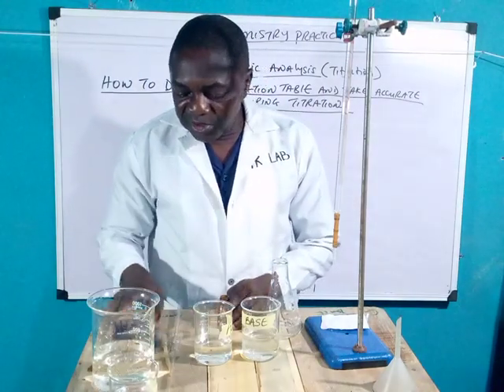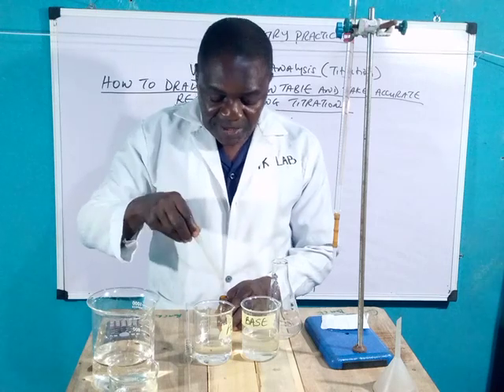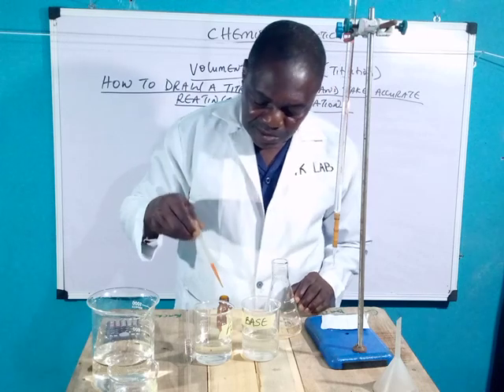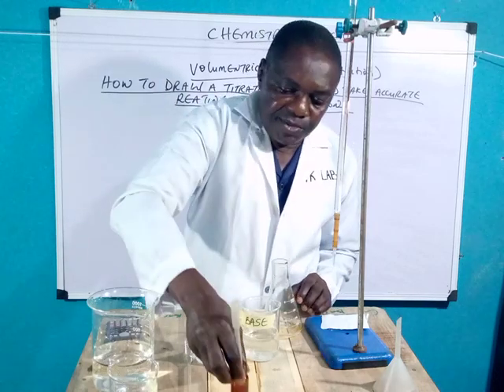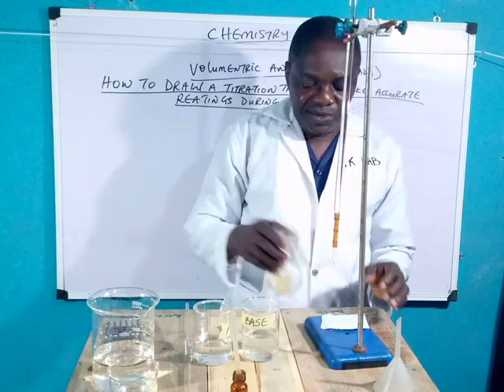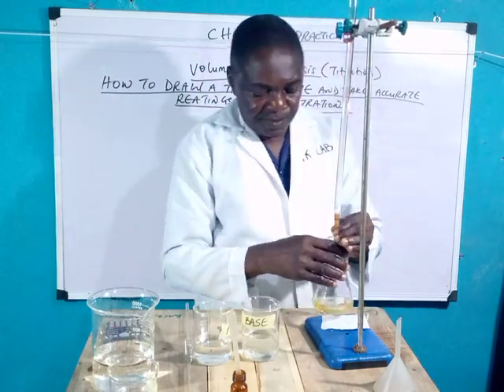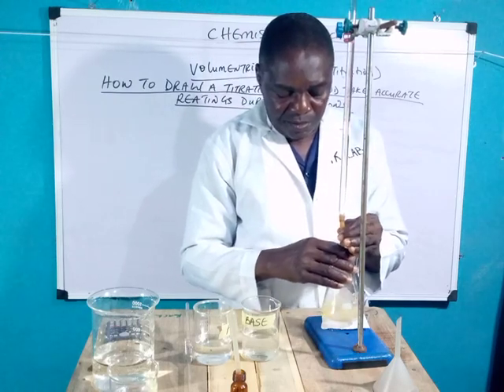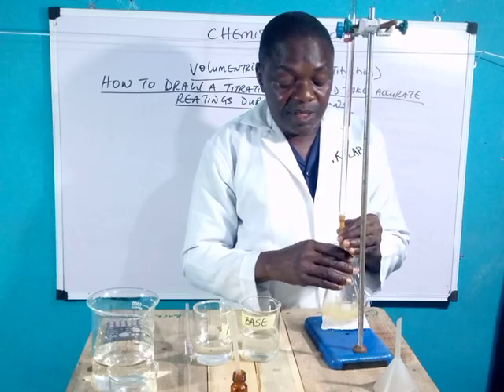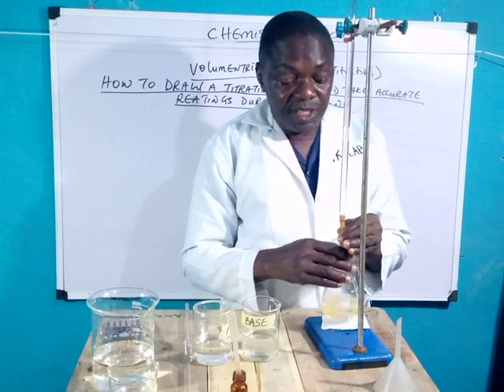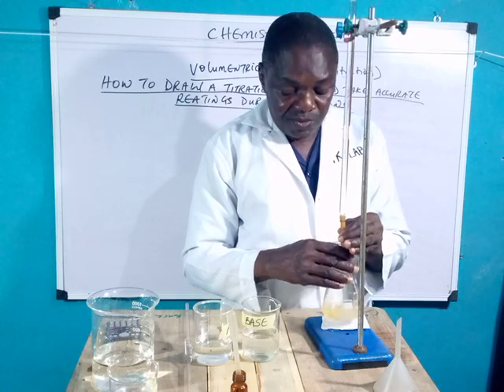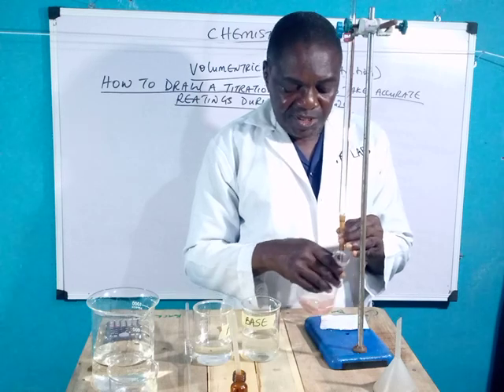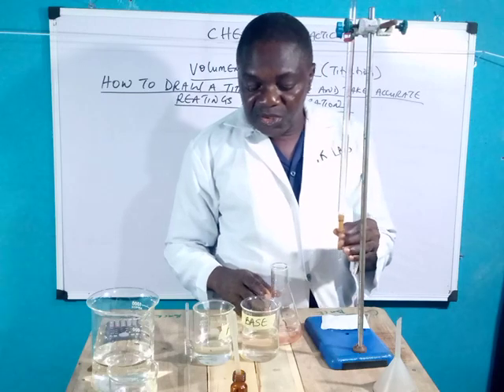Third precaution: remove the funnel before starting your titration. Usually about four precautions is what they normally ask. Add two drops of indicator from the dropper. This is the indicator — as you can see, the color is yellow. Now start the titration. Watch the readings from the burette; when the color changes you will know. It's almost changing — it has changed from yellow to orange. Now take your readings.